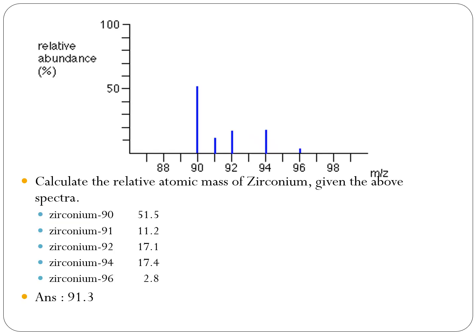Similarly, when we saw something like zirconium, because the element would have separated into its individual atoms, we saw that it had 5 peaks, each having a different mass. And this is an atomic mass spectrum, and everything in here is owing to simply the isotopic mass of each of the items, and their relative abundance will vary.